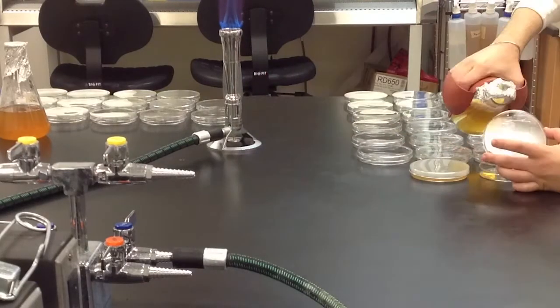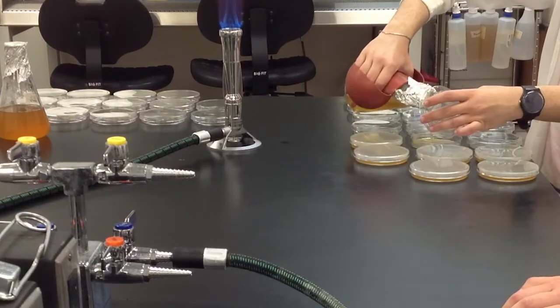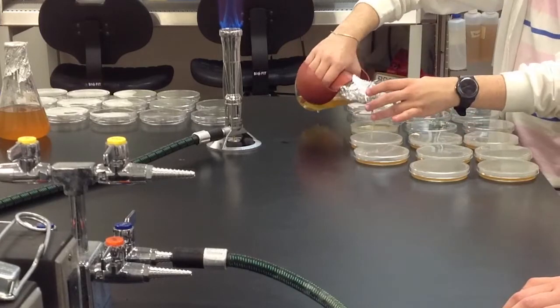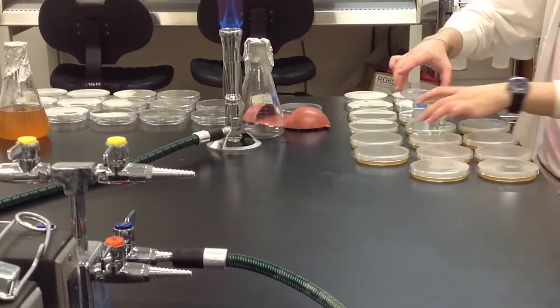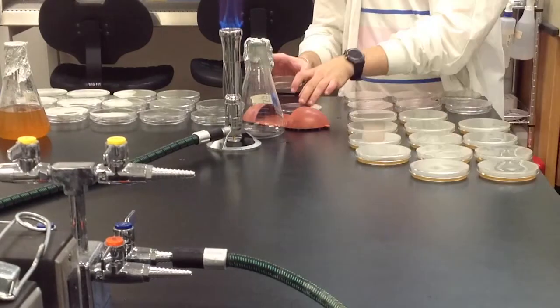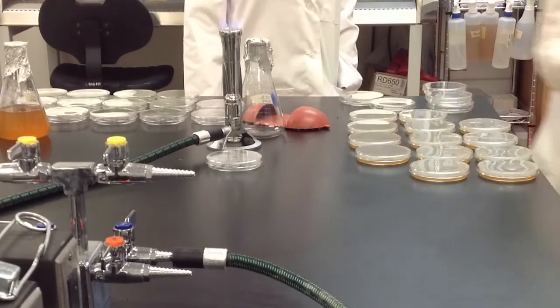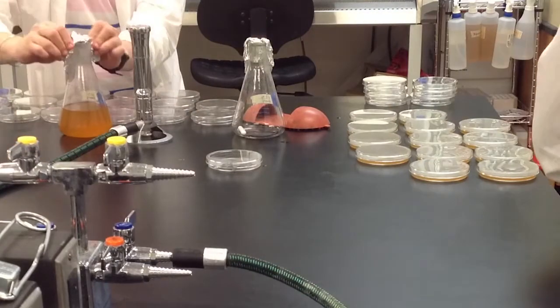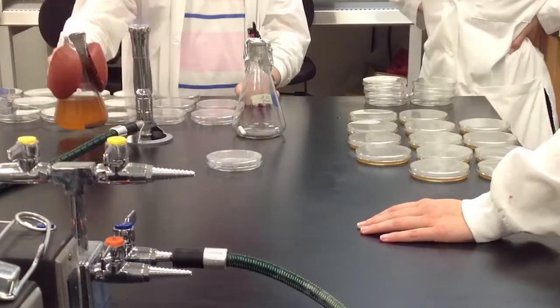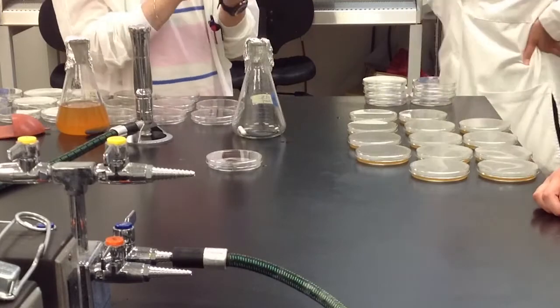We slowly poured enough nutrient agar into our Petri dishes so as to cover the full bottom surface of the Petri dish. We ever so lightly removed the cap, poured it inside, and covered it back up so as to not contaminate. We let them sit and we let them harden for about 20 minutes.